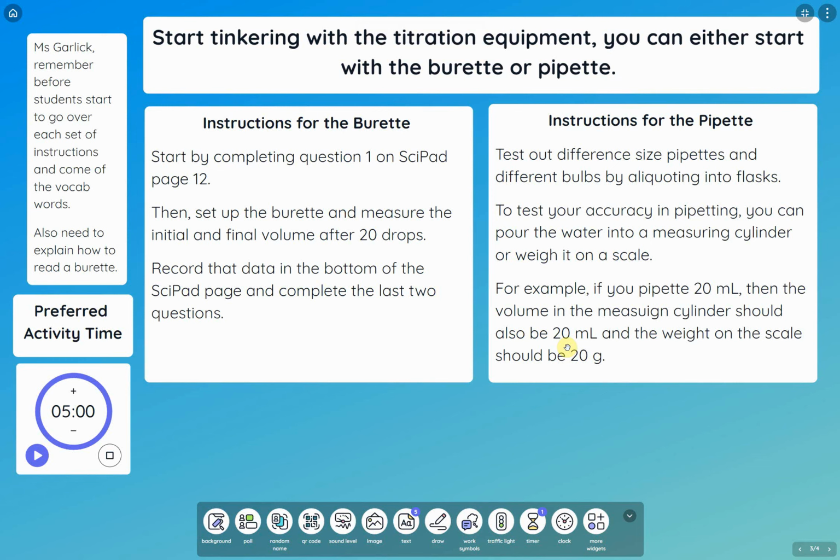There are other options too, like this bulb here that does a suck and escape. Some people really like this one because it actually holds the volume of the liquid, whereas this one can go up and down quite a bit, which is why I normally pull it off and use my thumb. The last one that people might like are these little rolly ones. The rolling pulls the water up. The problem I find is that sometimes you don't get enough volume with that one pull, so you have to pull it off, squeeze it, put it back on, and roll again.